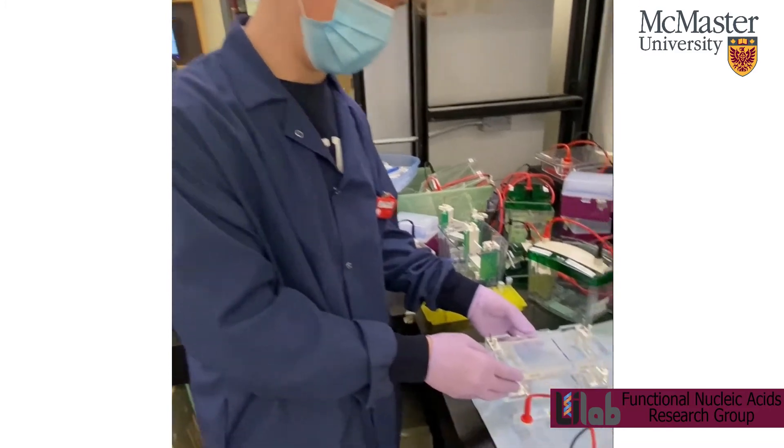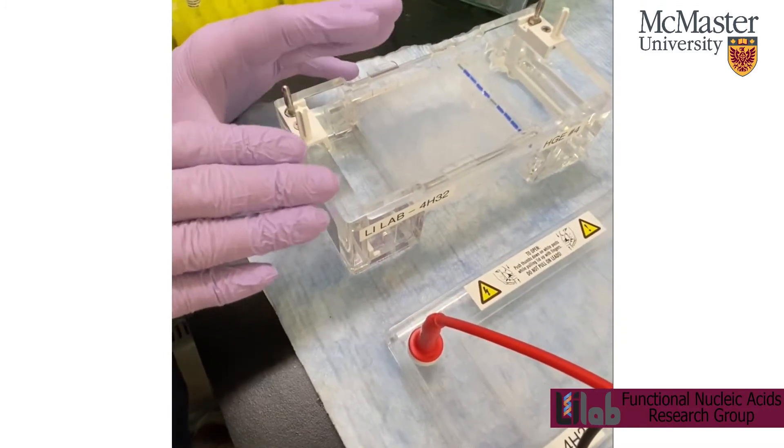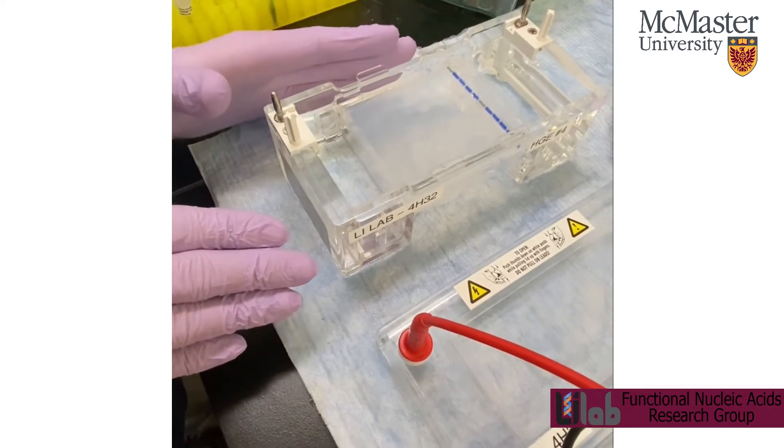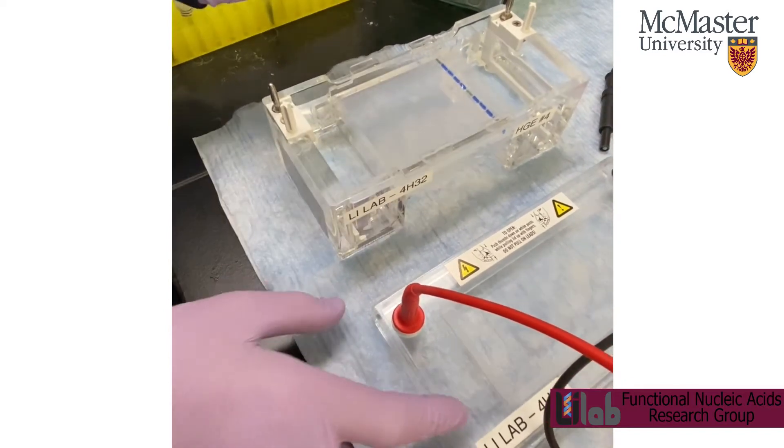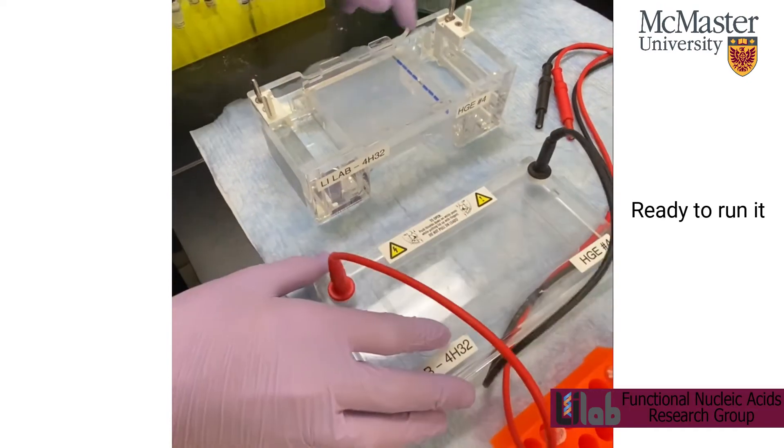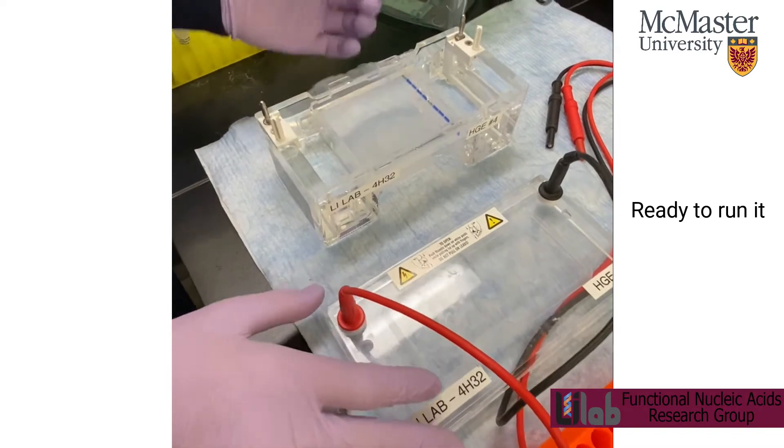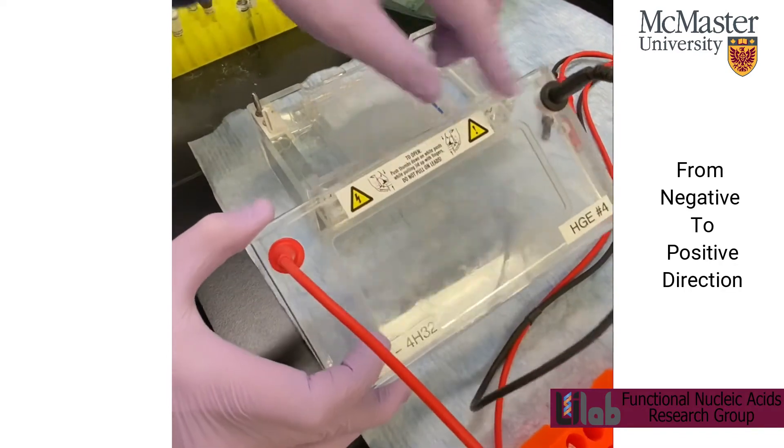So after the gel is finished polymerizing, I put it in the casting apparatus. And then I put the 1x TBE in just until it covers the gel. And then I loaded my sample. So now I'm ready to run it. So I'm going to make sure that the gel is in the correct direction. So we'll be going from negative to positive or black to red.